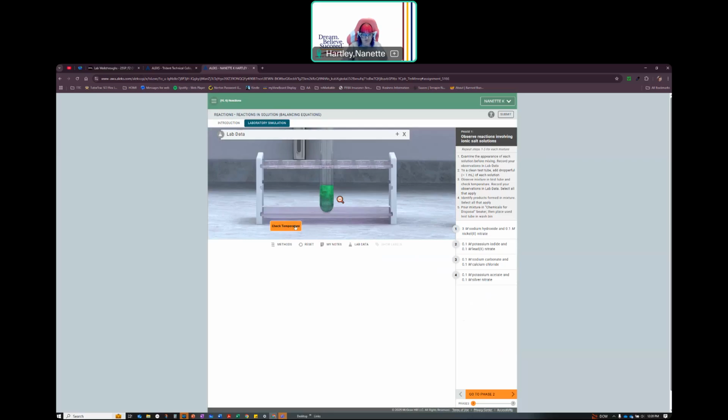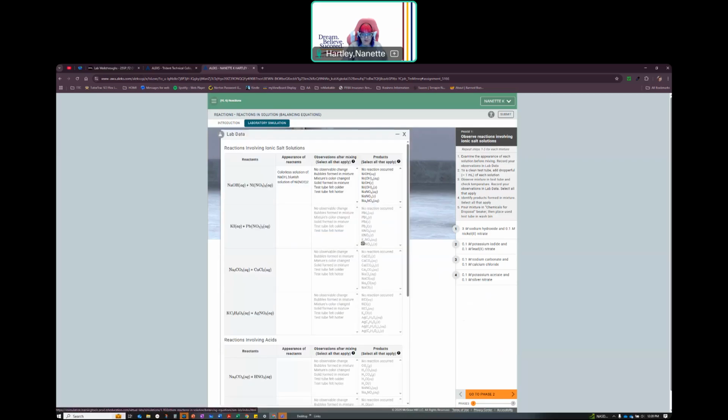I've got some stuff there, and it doesn't appear to feel hot. So in my lab data, I want to record my observations. I see that a solid is formed. And no, it doesn't feel hot, it doesn't feel cold.